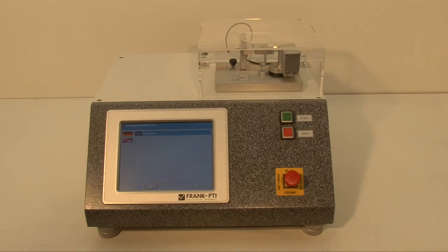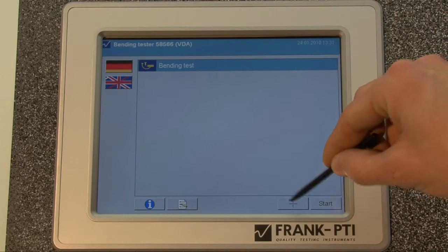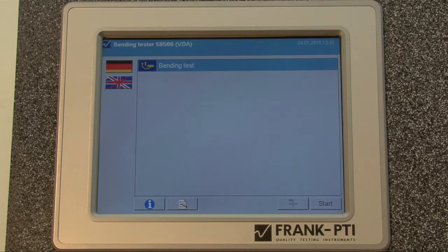When you turn on the bending stiffness tester you will first get this screen, where you have to push the small button to the lower right so the clamps will do a reference drive.